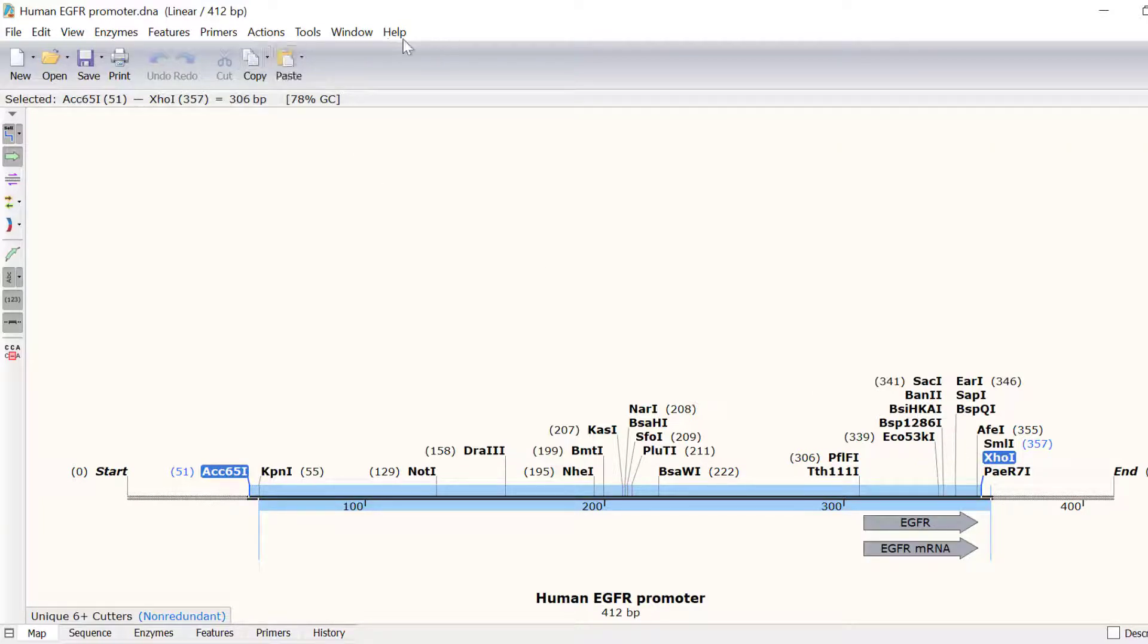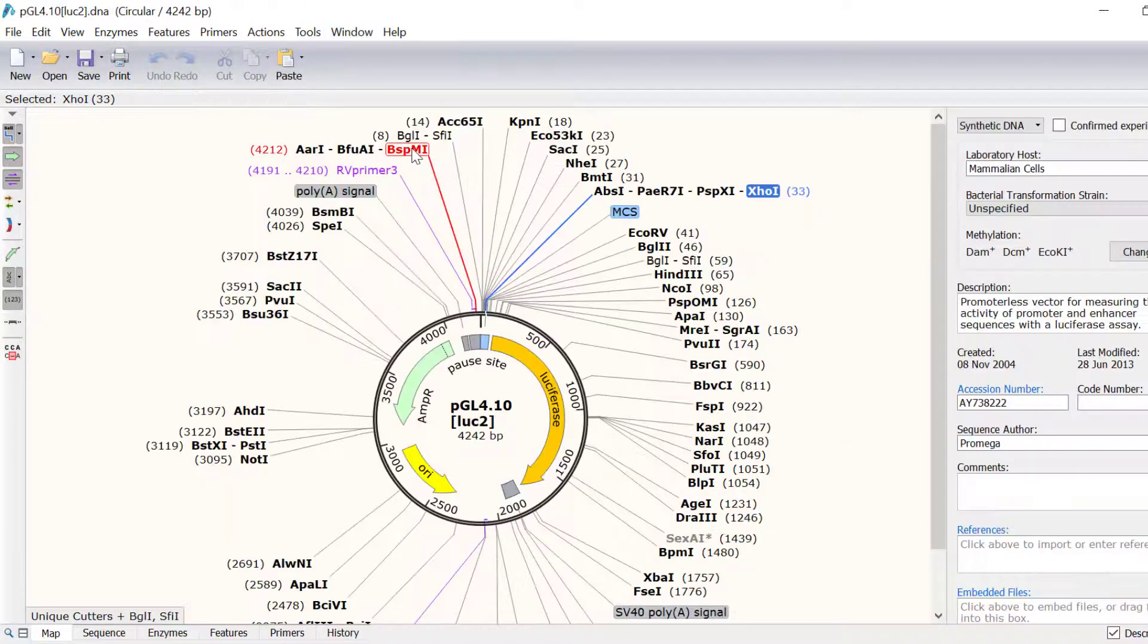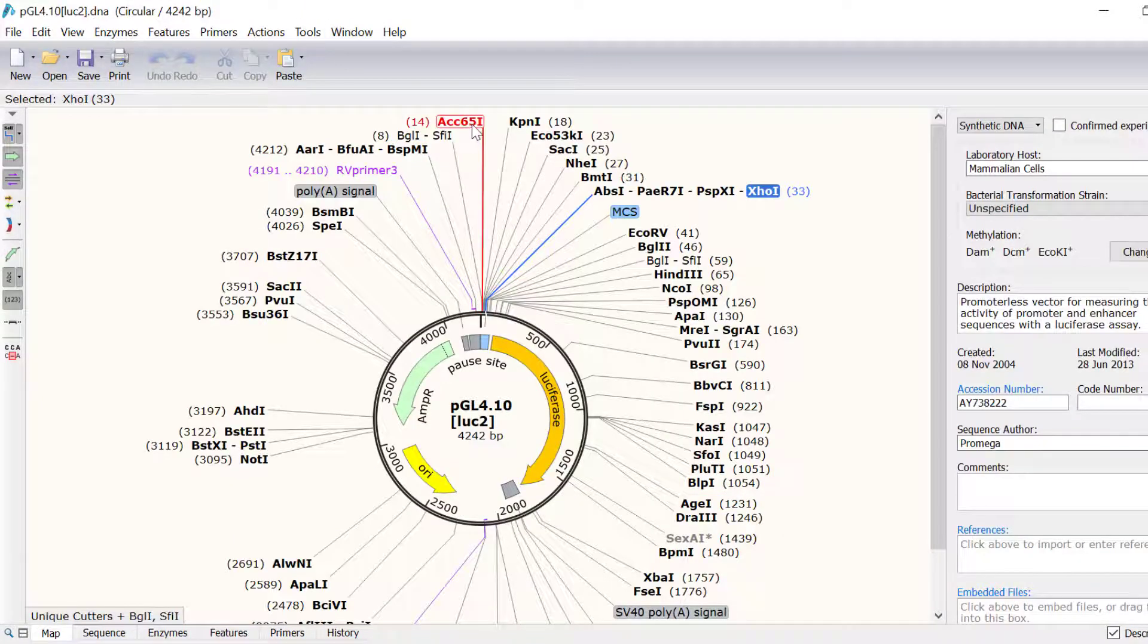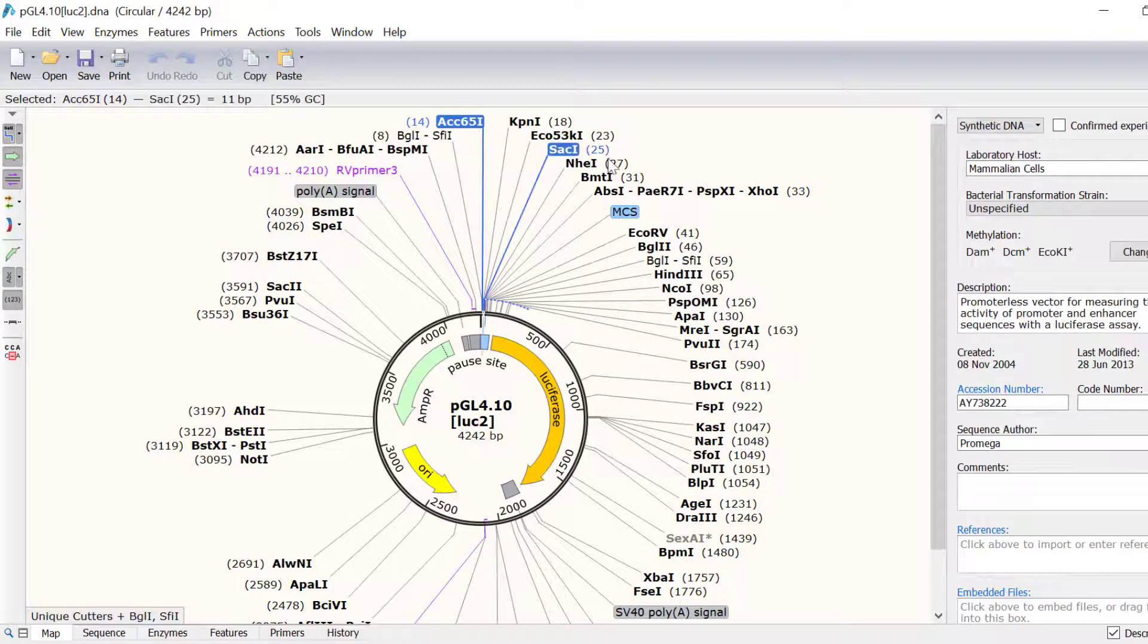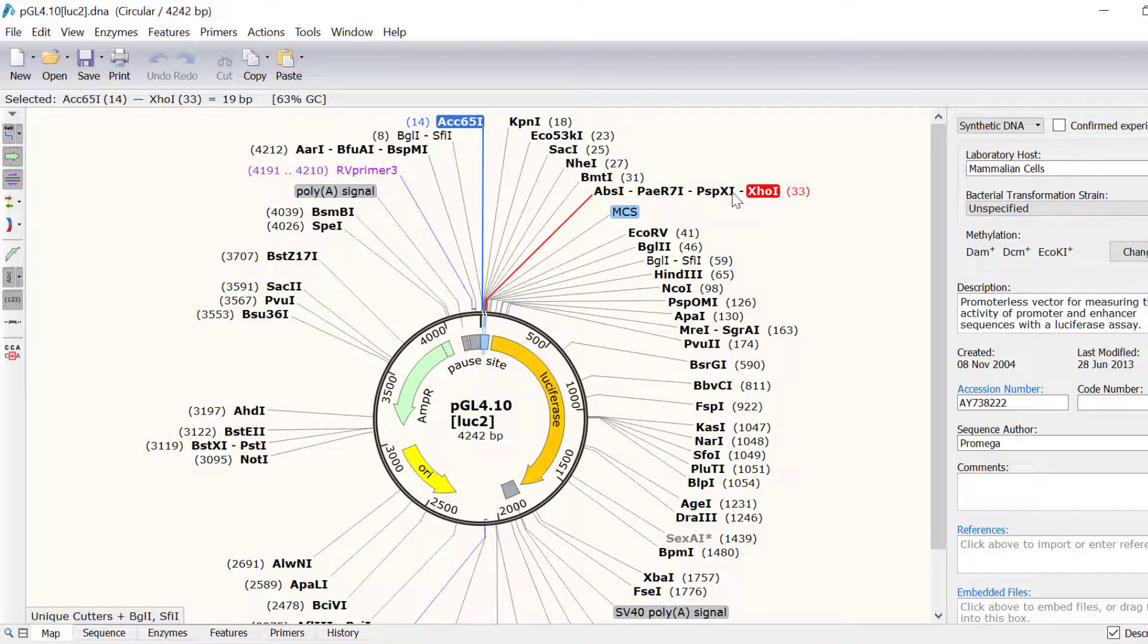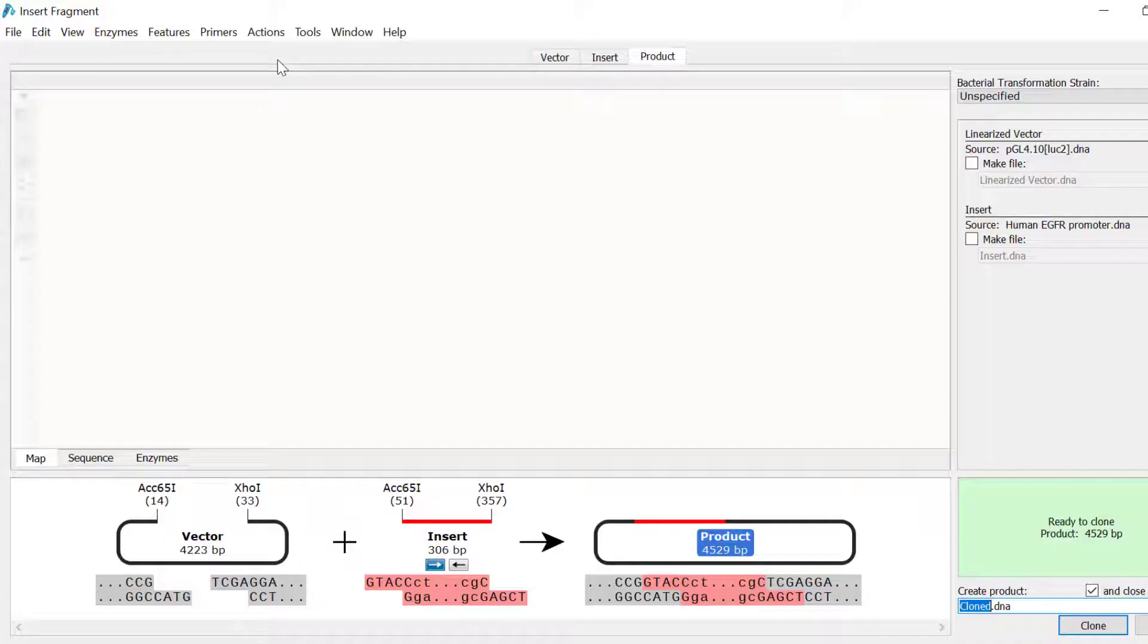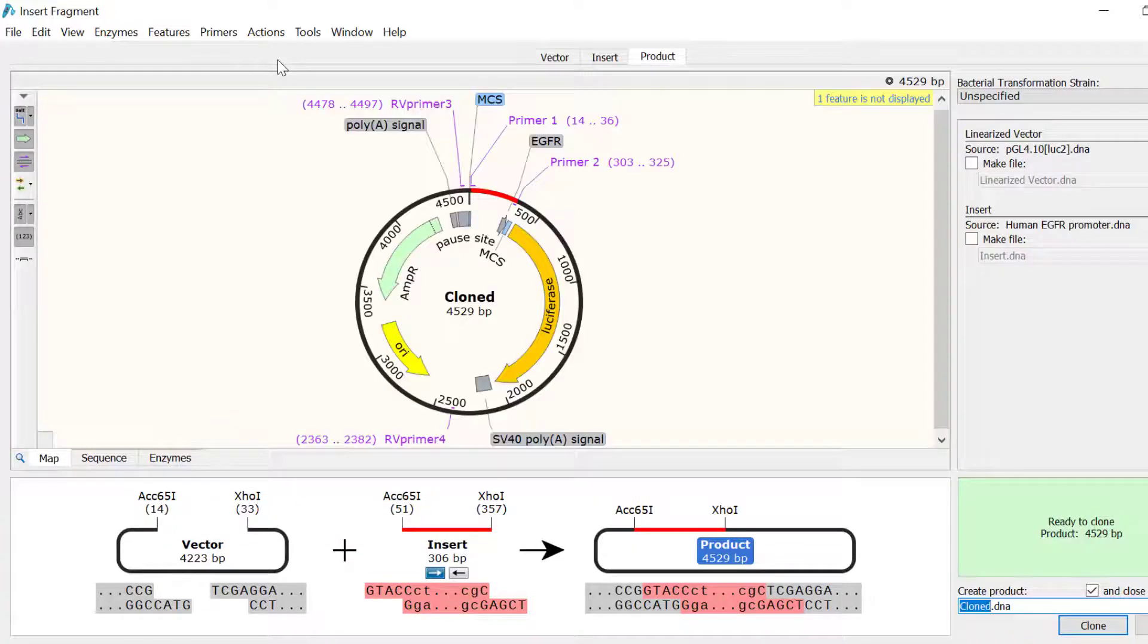Next, I will switch to my vector file and click and drag on the ACC651 and XHO1 enzymes. Then I will click the paste button at the top. This will open the insert fragment window as before, where you can preview and simulate the cloning.